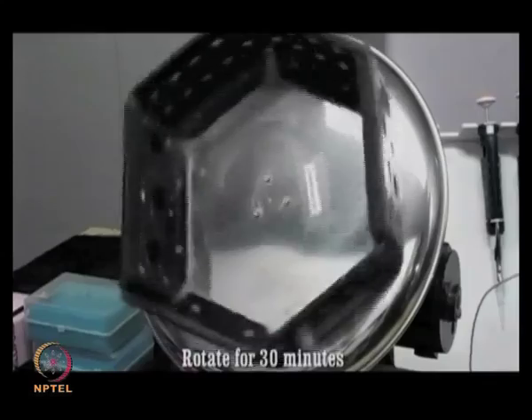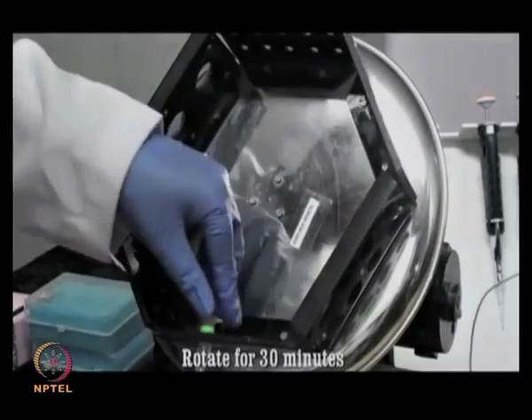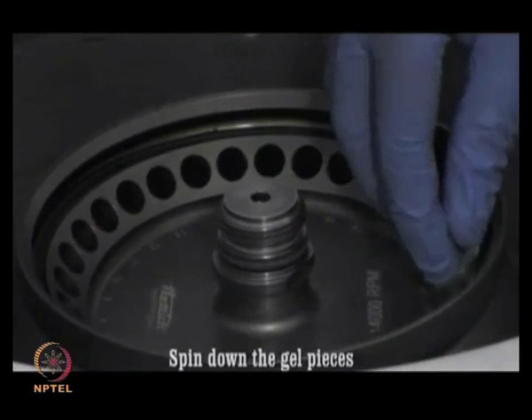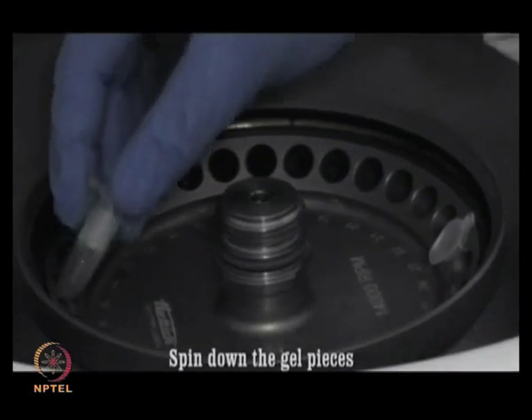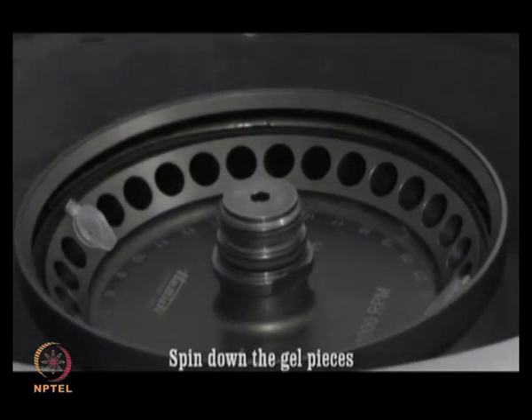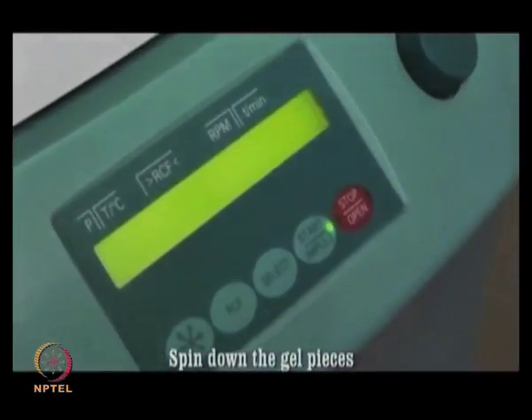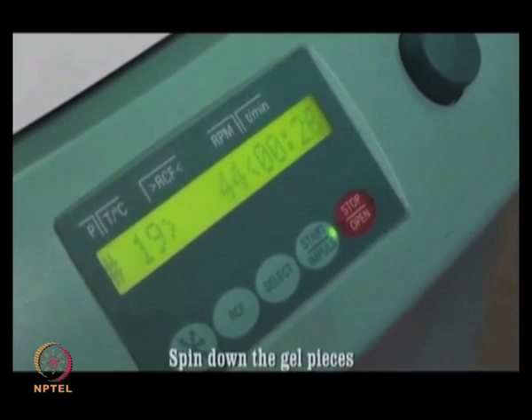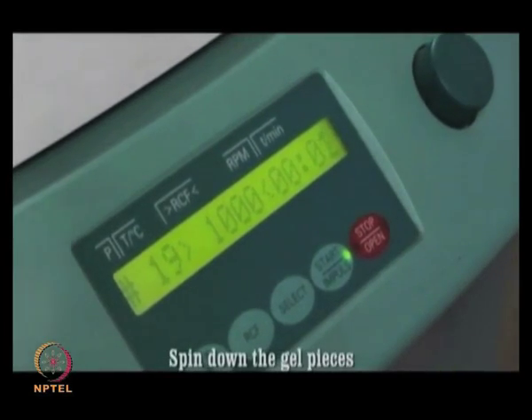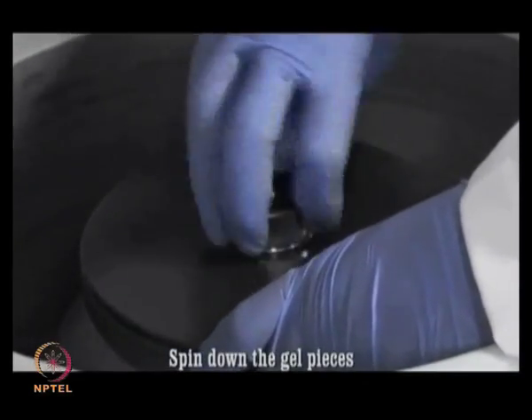You need to ensure that you change the solutions after every 10 minutes, so that the gel pieces become white and stick together. Now, spin the gel pieces down at 1000 g for 30 seconds. Once centrifugation is complete, remove all the liquid.